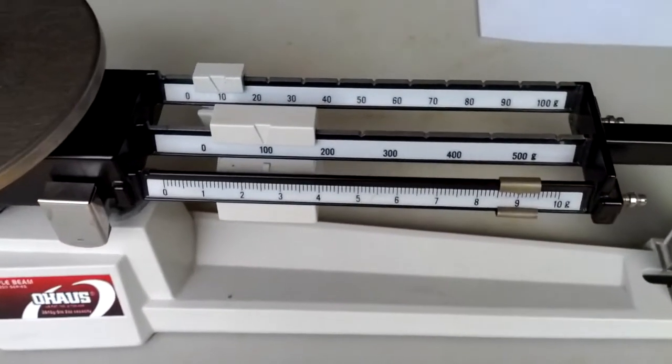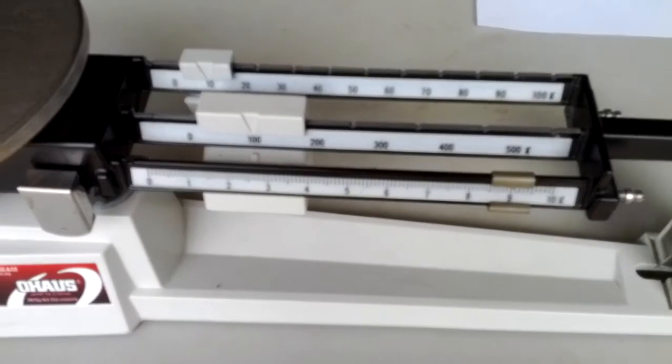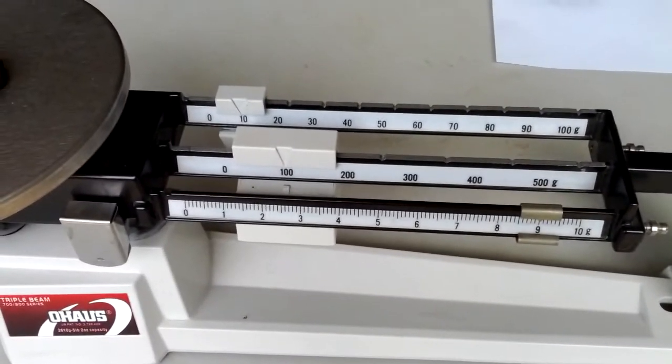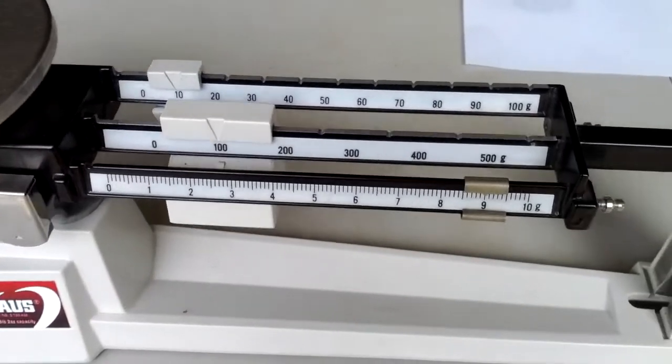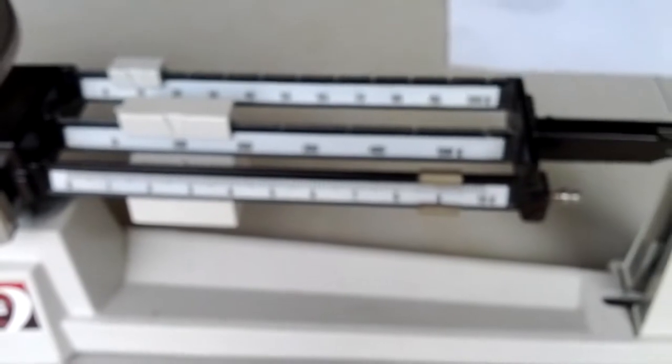So let's go back over here and look at that one more time. The hundreds rider is at a hundred. The tens rider is right at ten. And the ones rider is right at nine. So that's a hundred and nineteen grams.